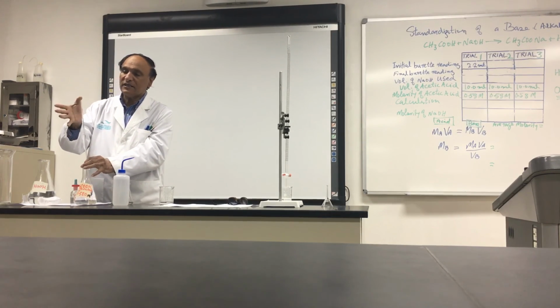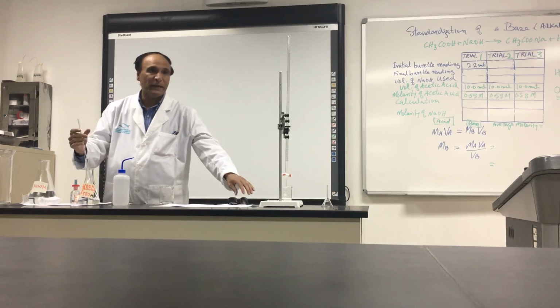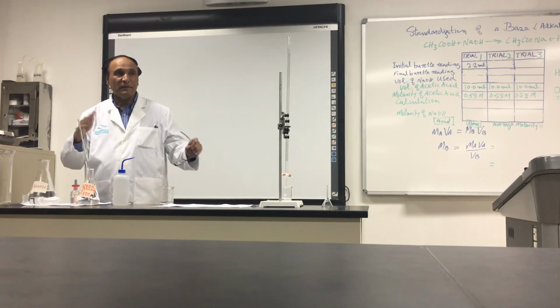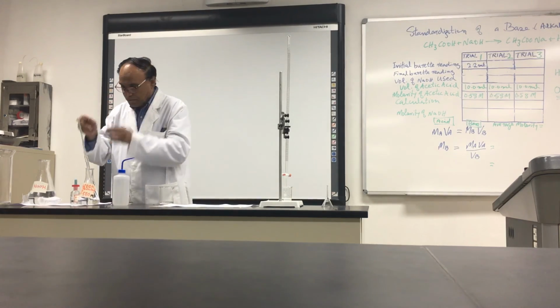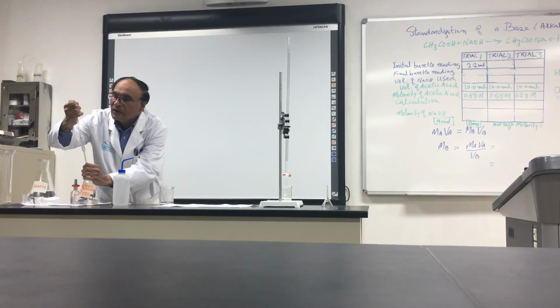So look, I hold it like this. If I release the air, it will go down. Look, it goes down. So do it again. You want to bring it up to the mark. Did you understand? Yes. Maybe it will take 5, 6, 7 times. No problem. Take your time. You are doing it for the first time in your life, so nothing to worry about the time. Hold it and do it very carefully. Release the air.